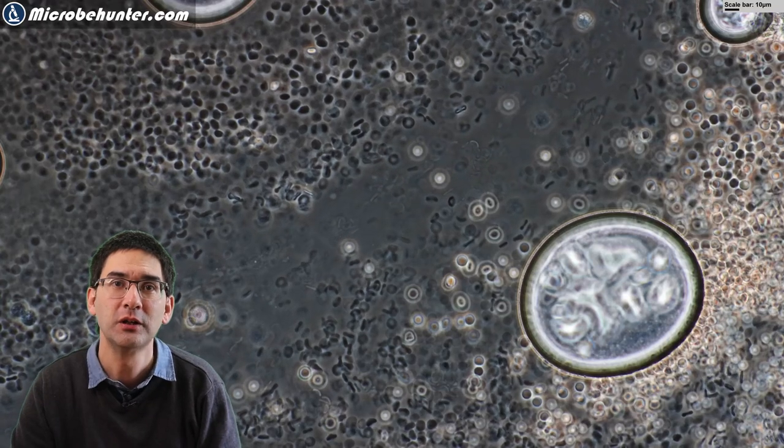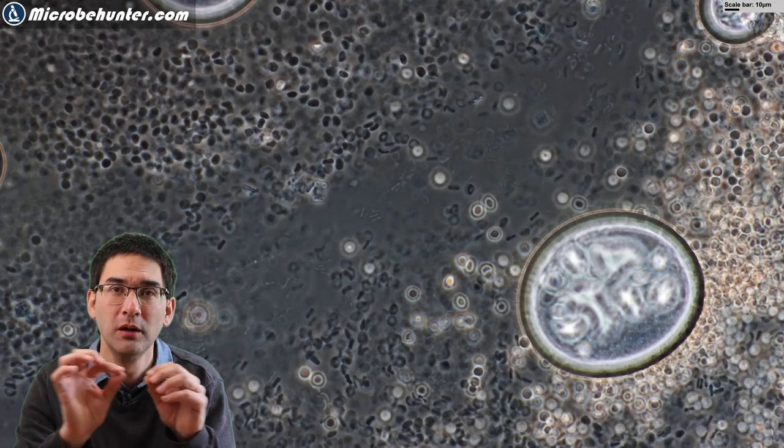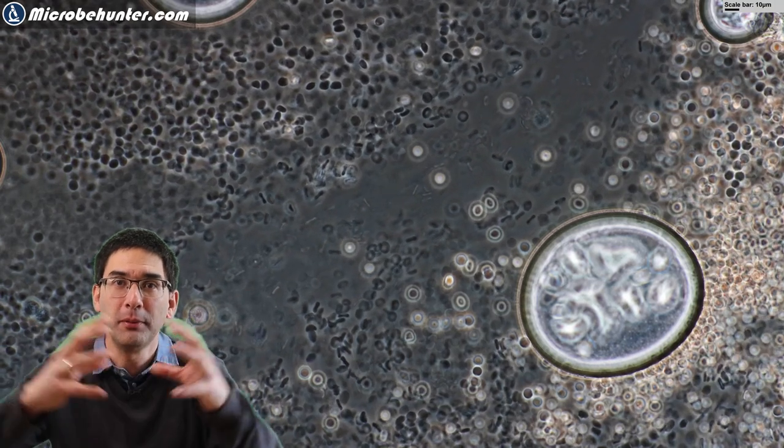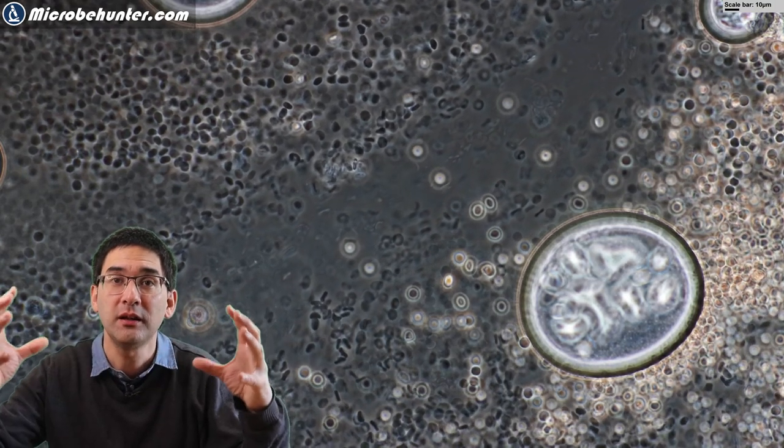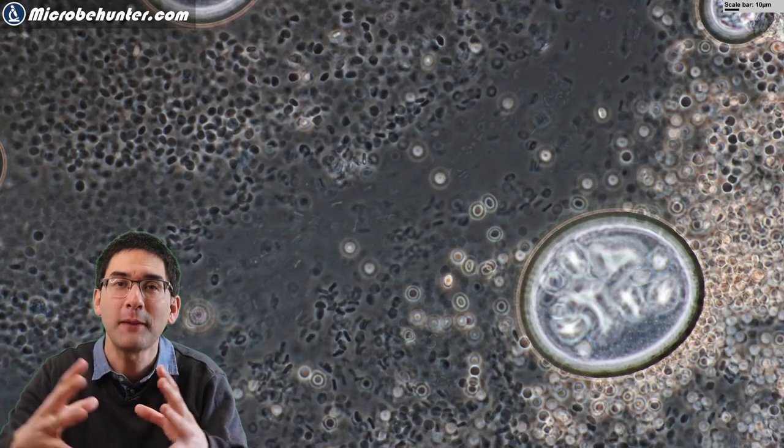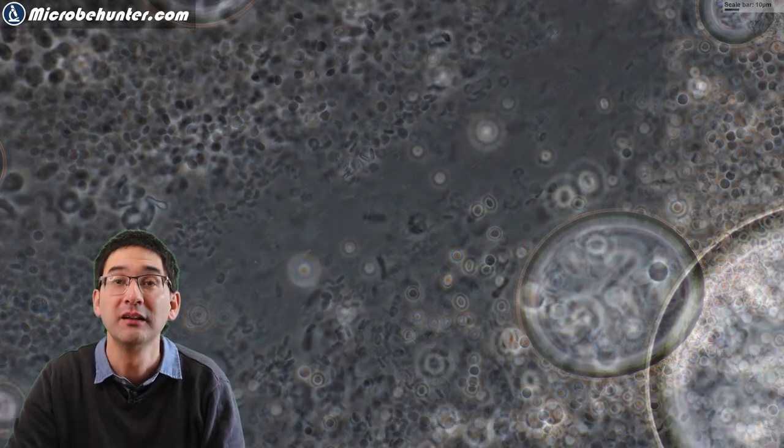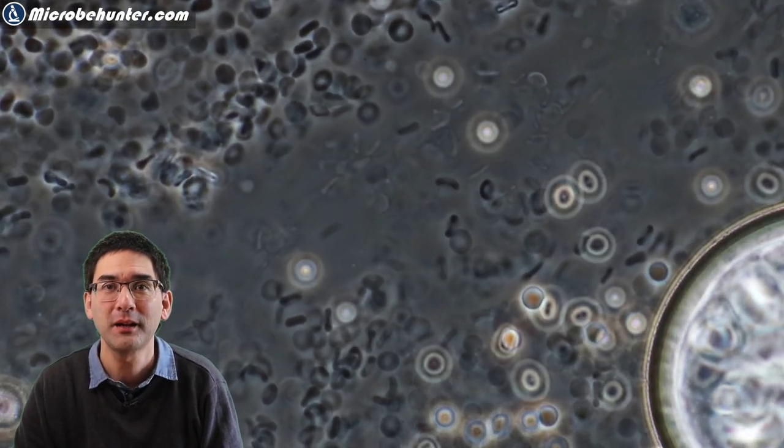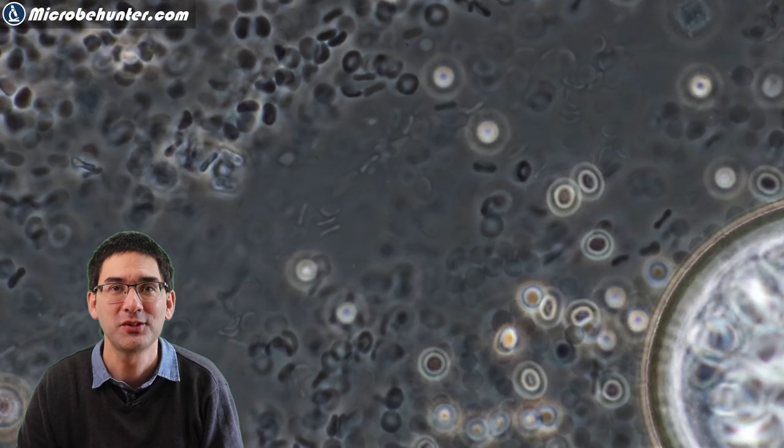You can see a large air bubble in the center and the small dark structures. I think these are all the empty red blood cells. They have blown up because of the water entering and then they popped open and then collapsed again. This is why they look a little bit small right now and not spherical anymore. In phase contrast, also quite nice to see.